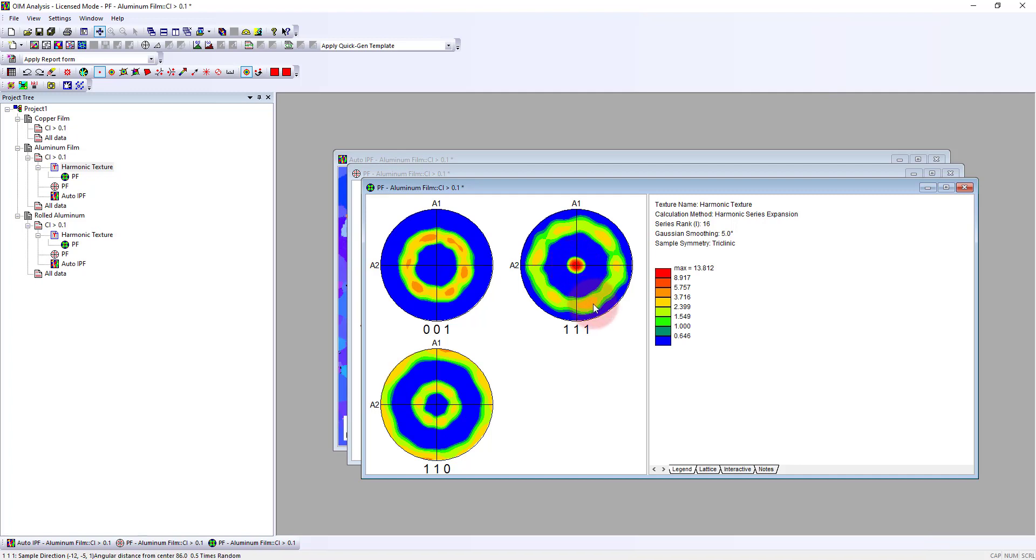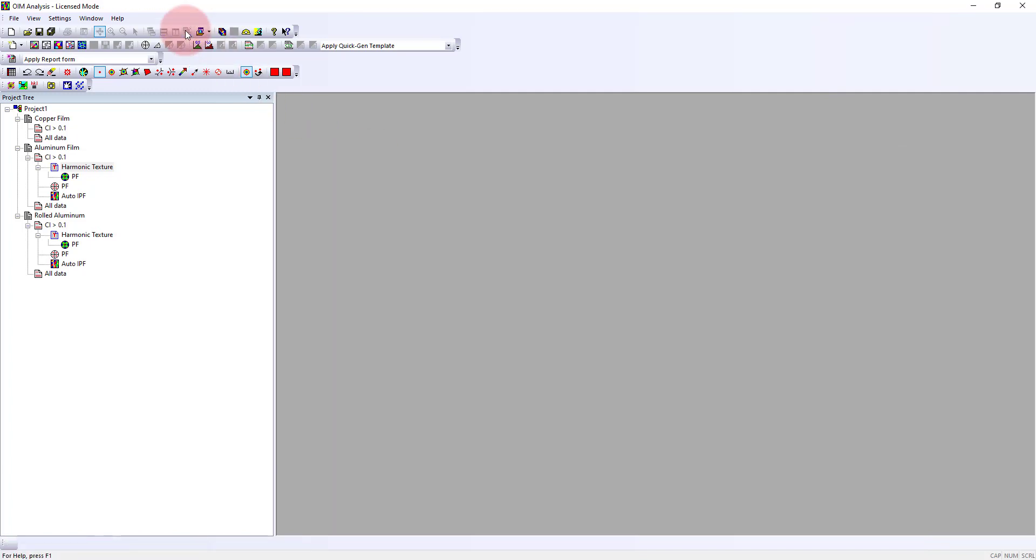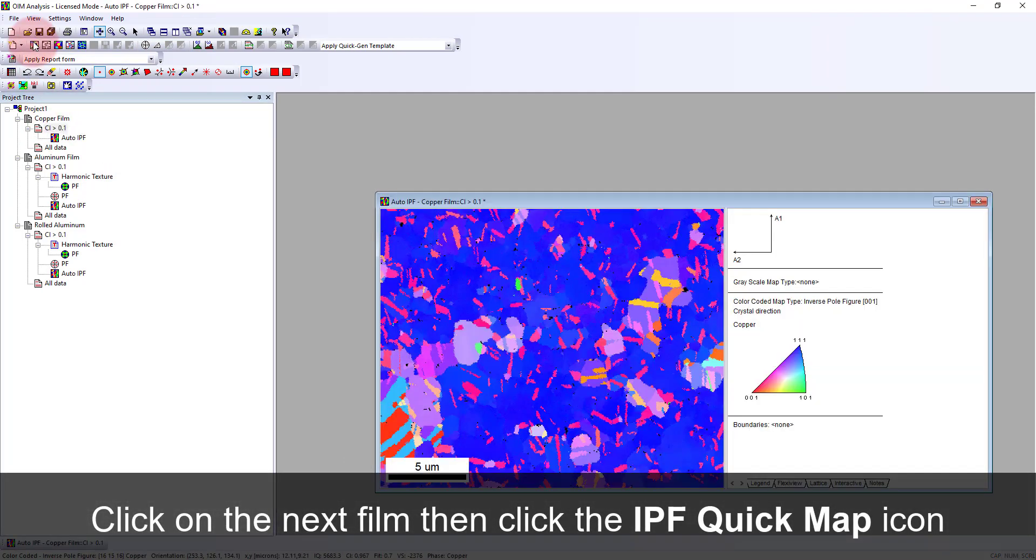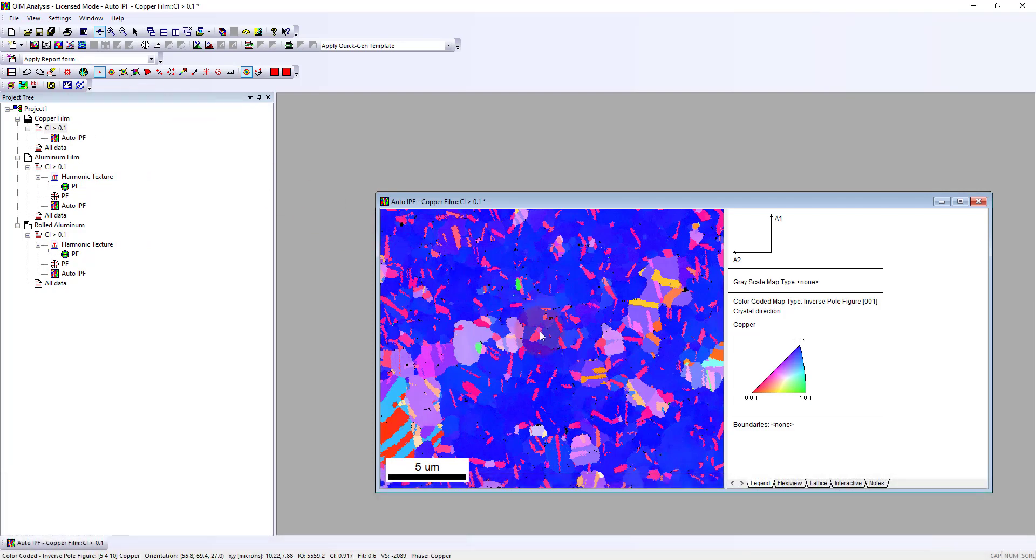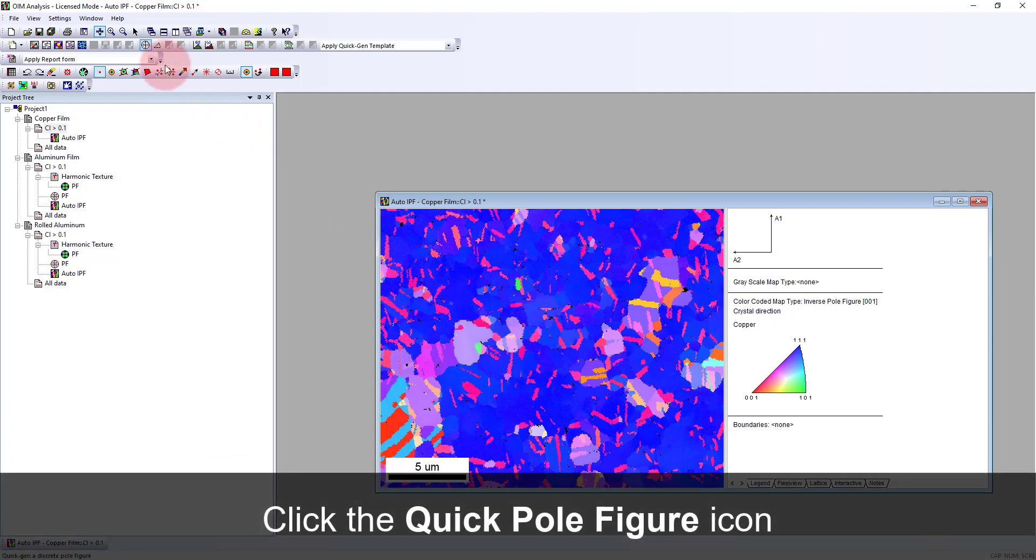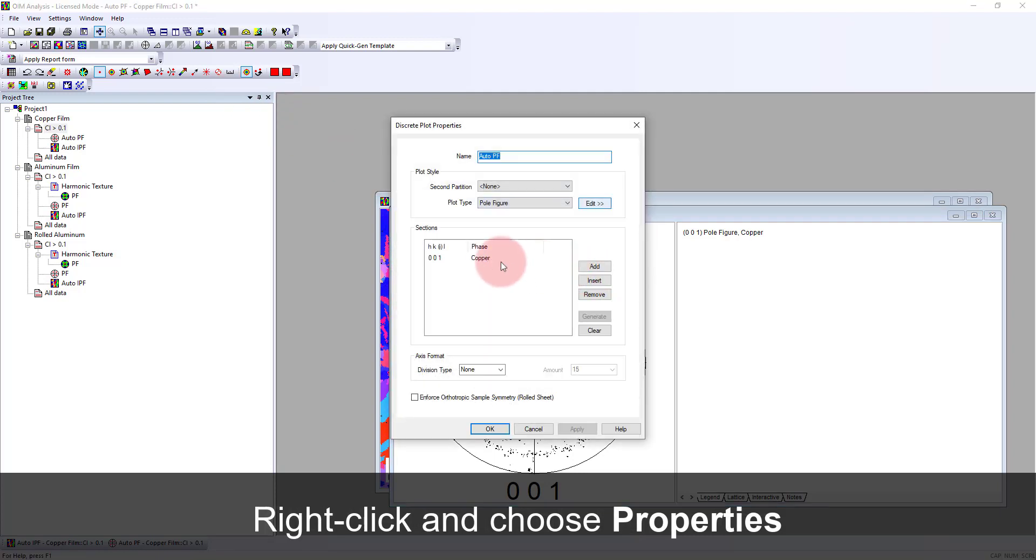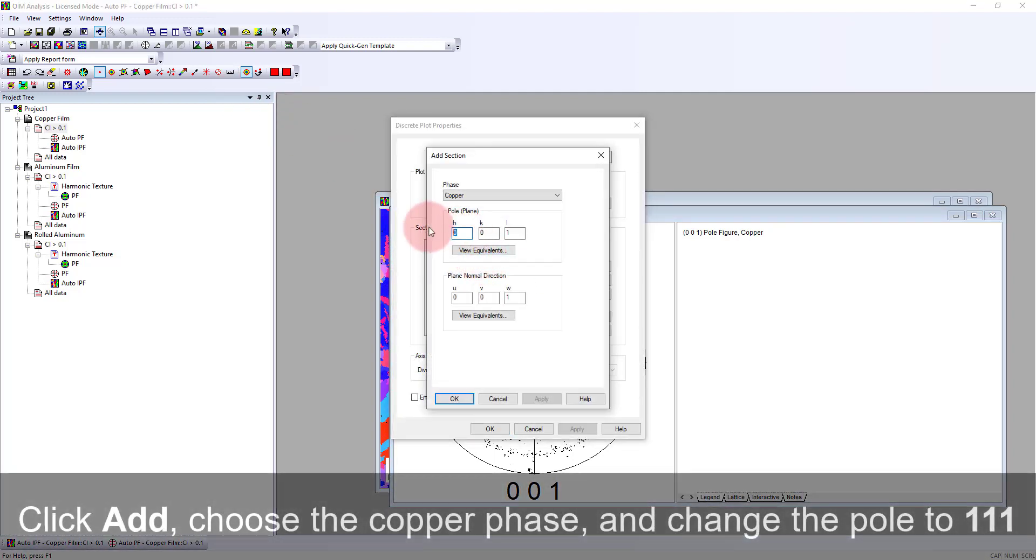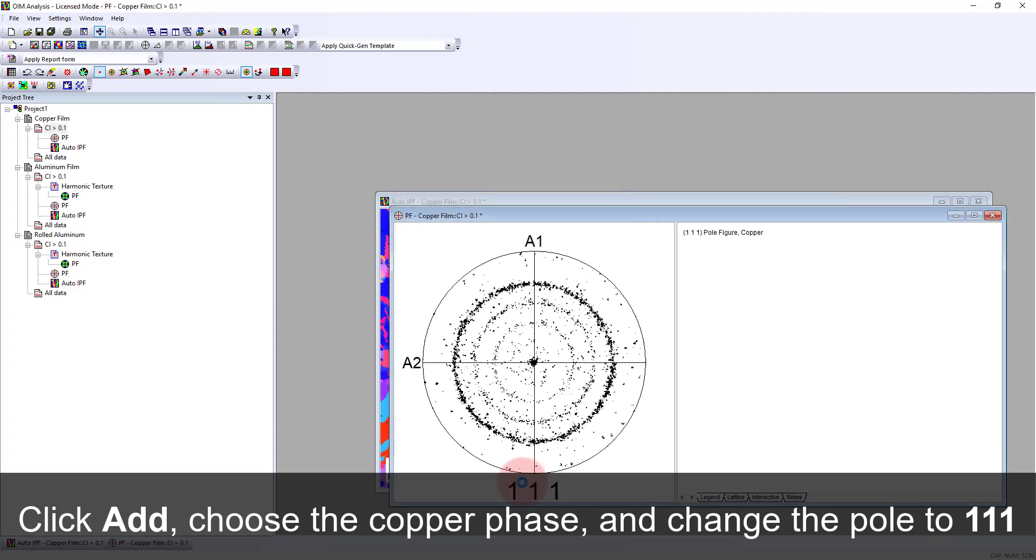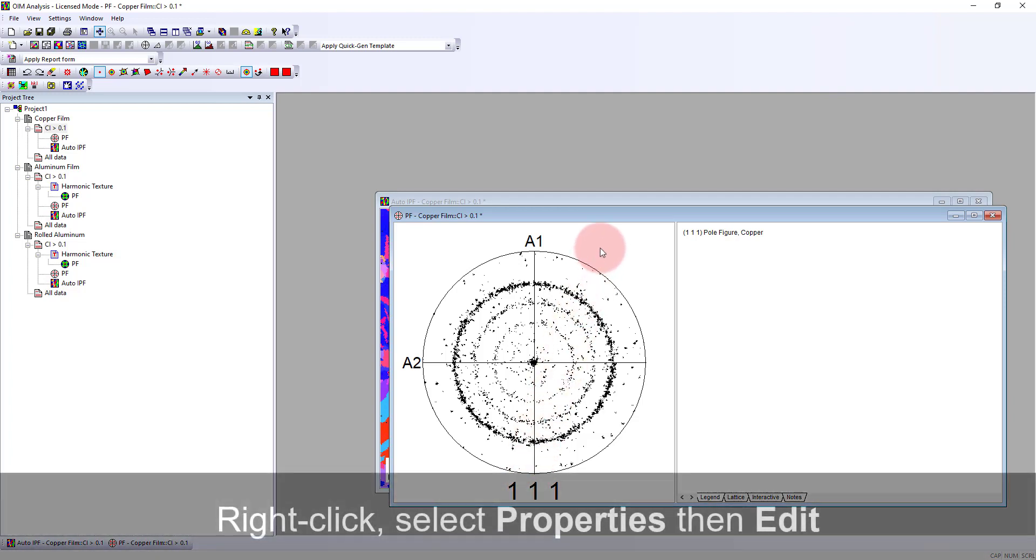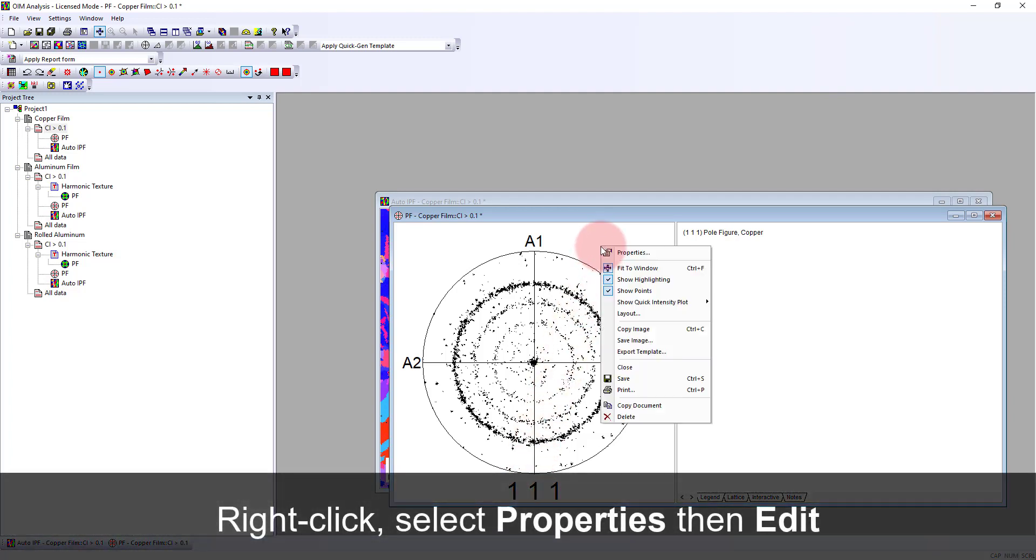The third thing I want to show is from an aluminum film to a copper film. We look at the orientations and it's similar that there's still a lot of blue, but there are also some reddish grains here. If we look at the pole figure and modify this to the 111, we see there are some different concentric rings around here.